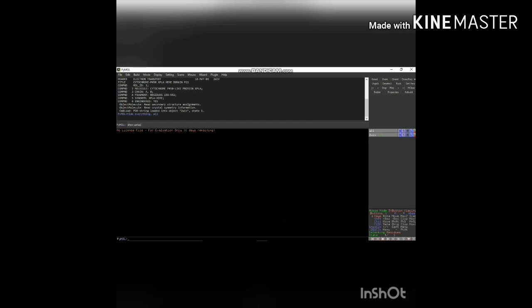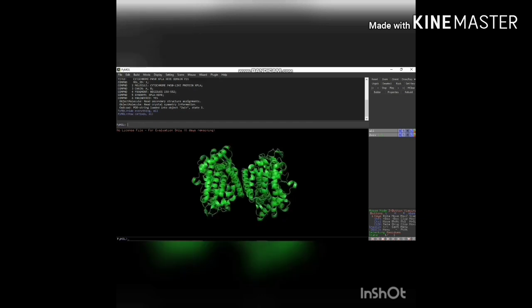Then give the command: show cartoon, all. The structure will be displayed only in cartoon model. This structure contains secondary structures like helix, turns, loops, and coils. I prefer to differentiate the secondary structures using different colors — purple, yellow, and green. Compared to tertiary structure, the secondary structure is mostly stable.